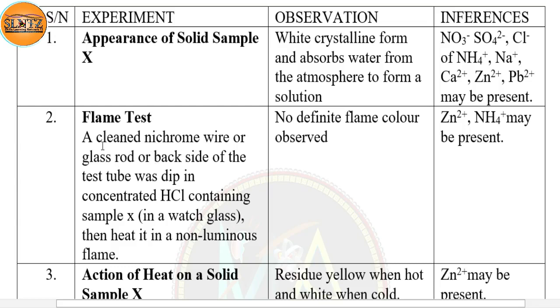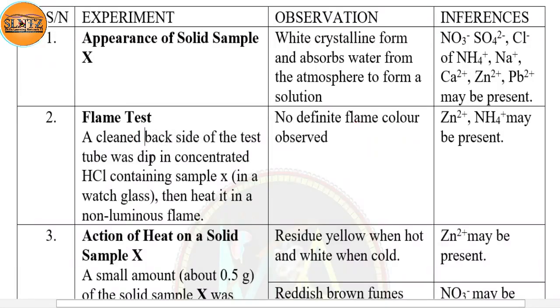So if you choose the test tube, you will see a cleaned back side of the test tube was dipped in concentrated hydrochloric acid containing sample X. Sample X in a watch glass, then heated.